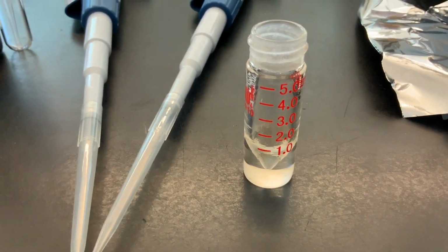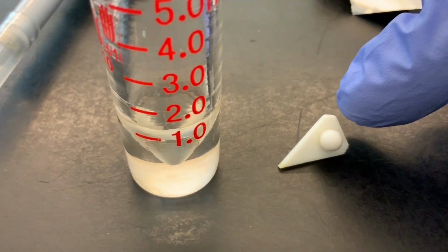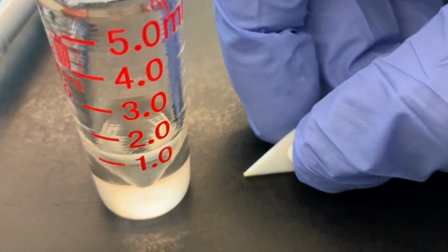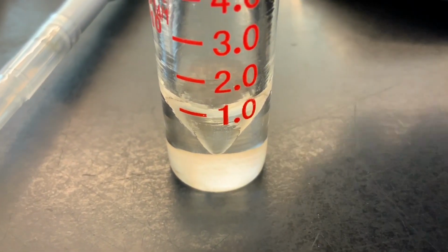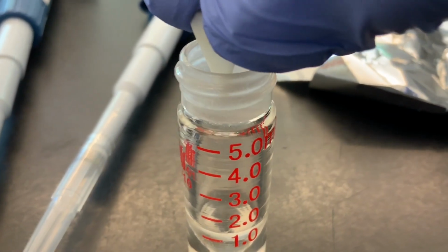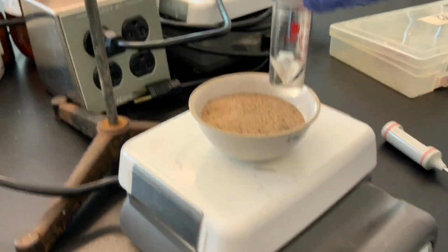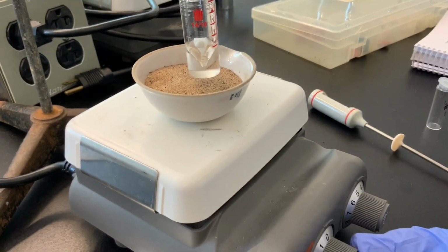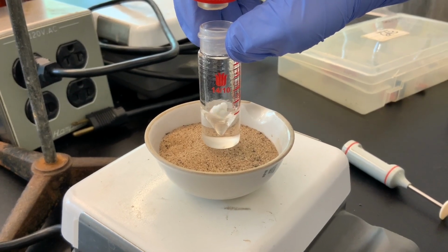But before we add the liquid, we want to add our Teflon coated magnetic spin vane. This is our spin vane, and we want the point, or the apex, to be pointing down so that it'll properly spin in our reaction vial. All right, so just like that. And you can always test to see if it'll spin properly. I'm changing the stir setting now, and you can see that yes, we've got spinning.